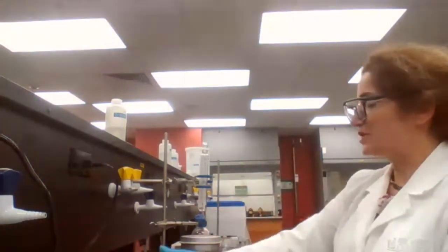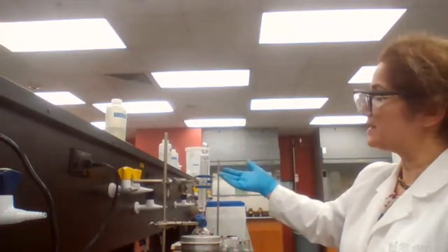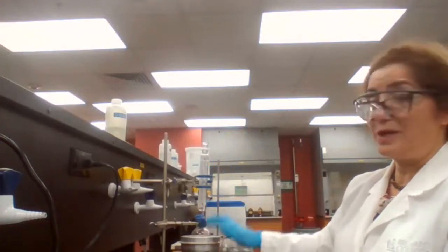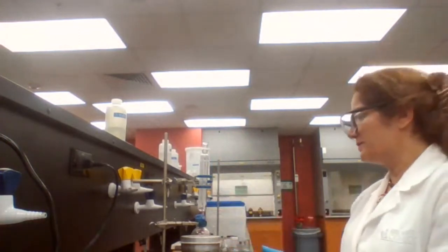If you apply too much heat, you will see vapor coming out of this. You are losing the sample, because your condenser is not efficient. Either you have too much vapor or the water flow is not efficient.